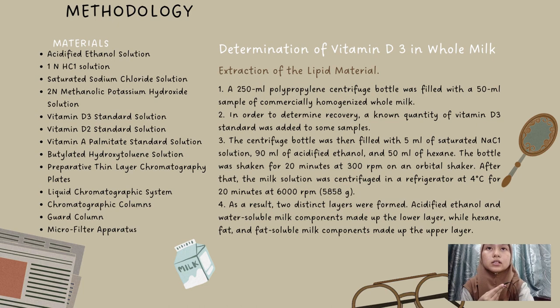The first procedure is extraction of the lipid material. A 250 ml polypropylene centrifuge bottle was filled with a 50 ml sample of commercially homogenized whole milk. In order to determine recovery, a known quantity of vitamin D3 standard was added to some samples.